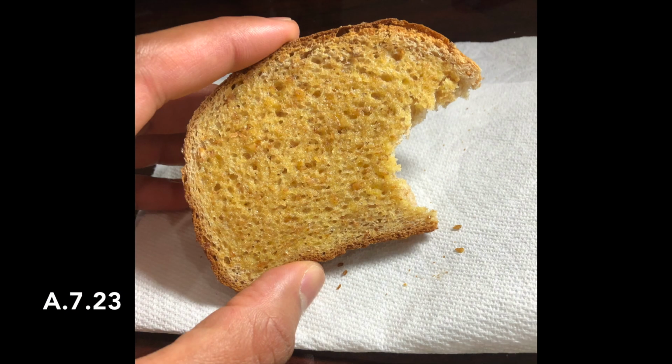if I wanted to reference a data file like a picture of the toast that I just made, I label the image of the toast with the lab notebook page A7.23, so that I can go back once I'm done this lab notebook and done this experiment, say that I did this experiment with these conditions following the procedure from a previous thing, and everything will be right there, and I won't have to worry about it when I'm writing the manuscript. So it saves time and keeps everything tidy, and you know that your data was right, and you don't have to worry that someone's gonna say that your data is wrong.